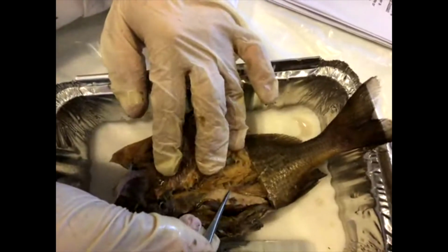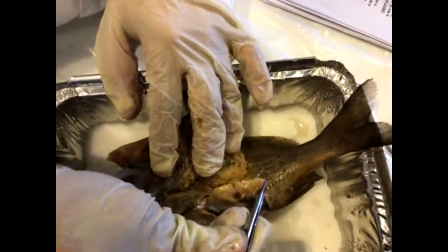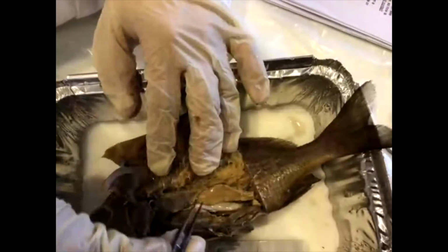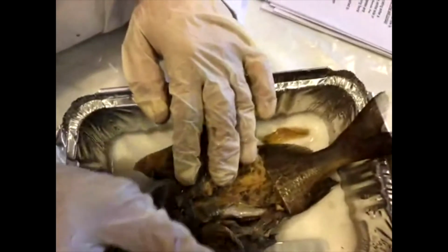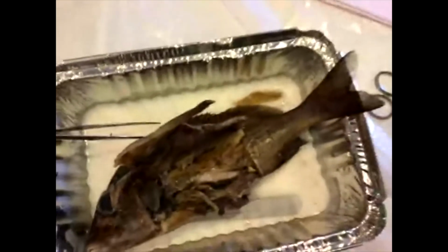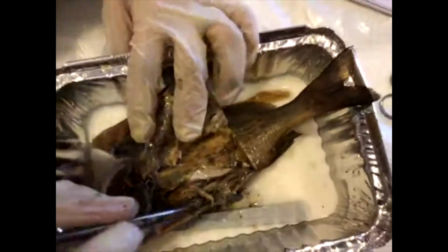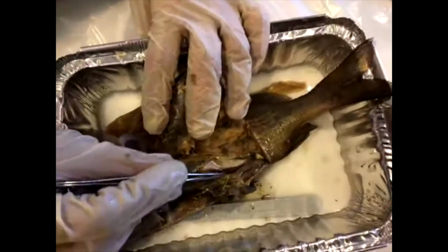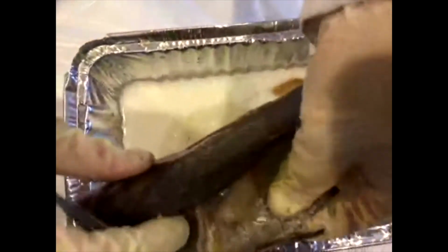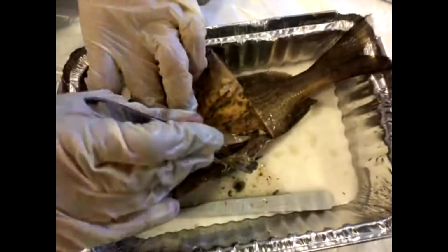This is the testes. So I'm actually going to remove this because we need to be able to see some of the stuff underneath. And in a female, they instead have ovaries. It would probably be about 3 times this size. And if we were to open them up, we'd be able to see tiny little eggs. So we're just going to put the testes here, and we can see some of the other parts here. I'm actually just going to get a tiny bit of water to rinse it out. So in females, the ovaries are quite a bit larger, and so they'll actually press all of the fish's other organs really down far, and they're squished into the bottom. So in terms of learning about anatomy, a male fish is a little bit easier for us to see what we need to see.